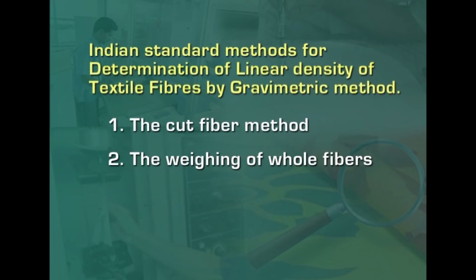The second method is weighing of the whole fibers as described earlier. It was observed by few workers that the fiber weight per inch varied with different group length of fibers, but the extent of variation was not the same in all varieties of cotton. Also, there is a possibility of fiber weight per unit length being variable along the length of a fiber.